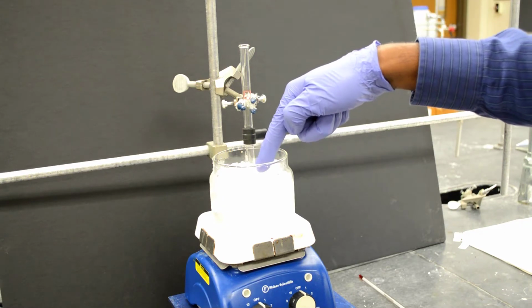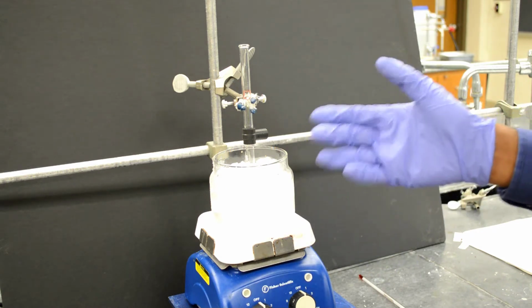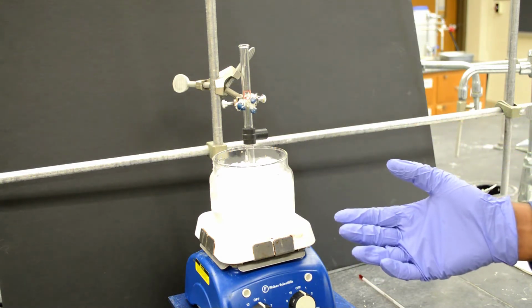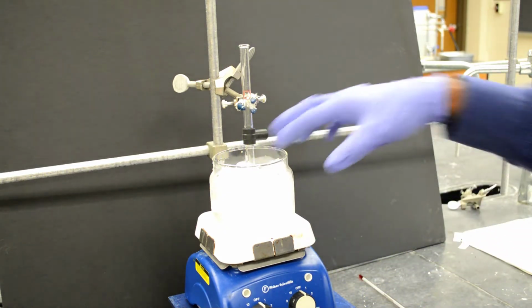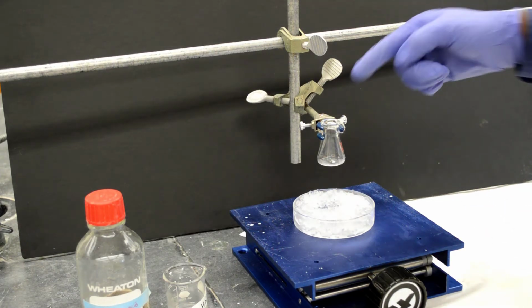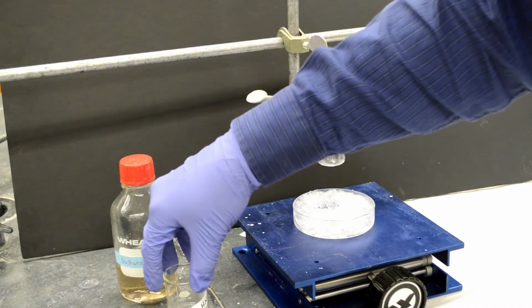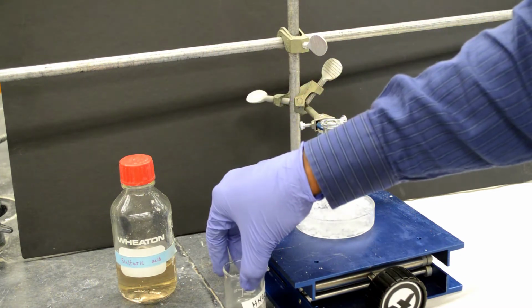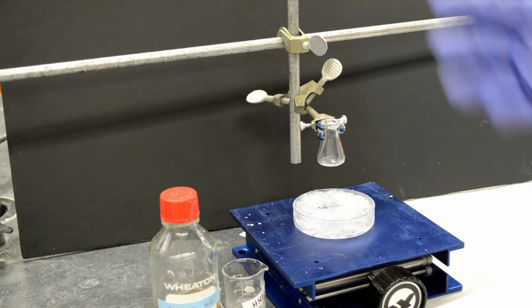The reaction mixture is in the ice bath because when you add nitric acid and sulfuric acid, the reaction can go exothermic, which means it can produce heat. In order to contain the heat, we put some ice. Now on the side, in a separate flask, we're going to add half a ml of sulfuric acid and half a ml of nitric acid. So that is our reagent. The mixture of nitric acid and sulfuric acid is our reagent for this nitration reaction.